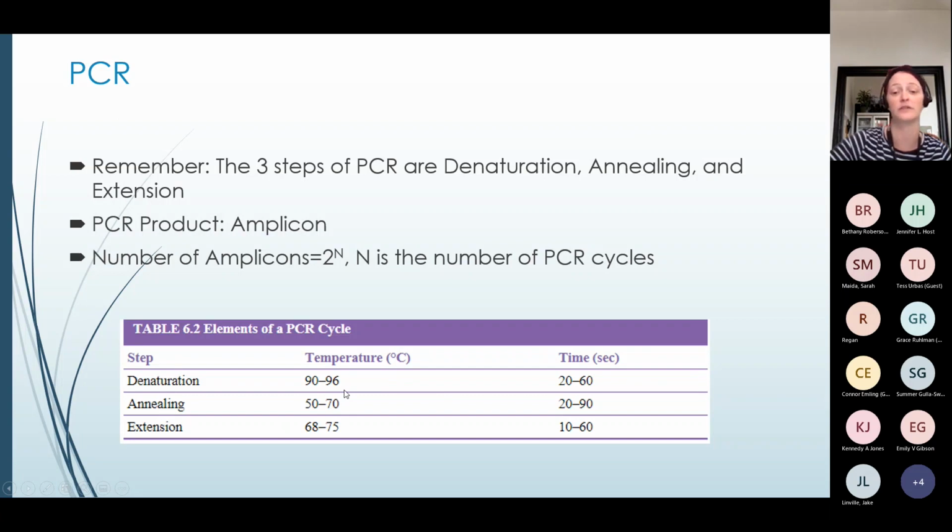Annealing, you cool it down, right? You're bringing it down, things can settle. They're not vibrating, going crazy. Think about the kinetic theory. The hotter you are, the faster your particles are moving, so your DNA can break, and then you slow down, your particles are slowing down in there. You cool down, you can meet up again, chill, hang out.